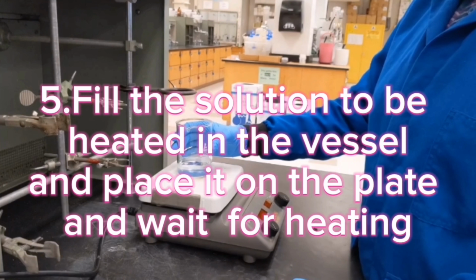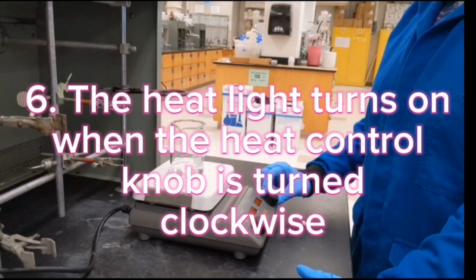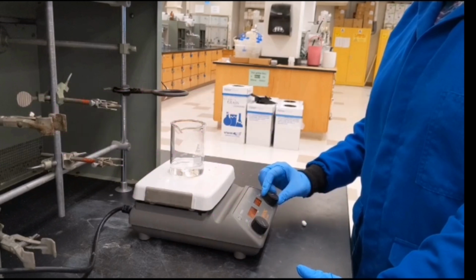Number five is to fill the vessel with the solution to be heated and place it on top of the hot plate. But the vessel, the beaker or flask, must be placed in the center, because if it is not in the center, there is a possibility that it will fall and break. Number six is to turn the heat control knob clockwise to our desired heat setting.